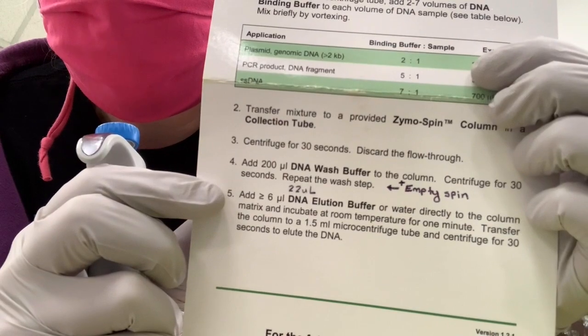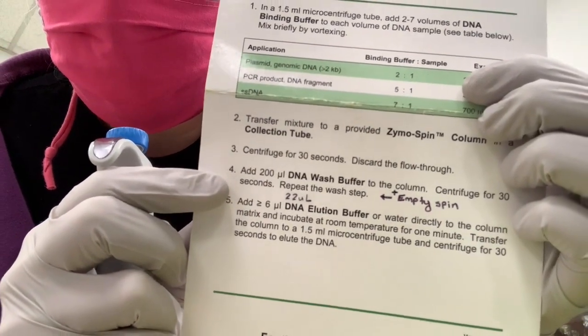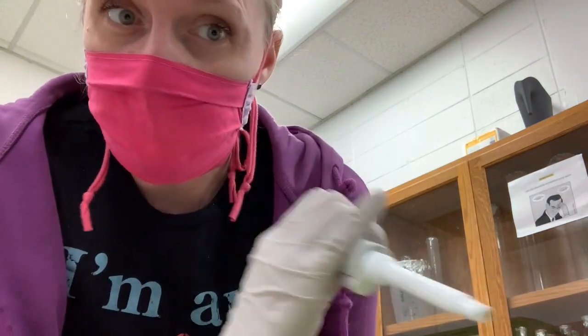And it says centrifuge for 30 seconds again. So I'm going to pipette 200 microliters of the DNA wash buffer into each tube. You can use just one tip if you don't touch anything, but if you go into the wash buffer and then touch your tubes, get a new tip, okay? So I'm going to do that for all of my samples, and then I'll be right back.